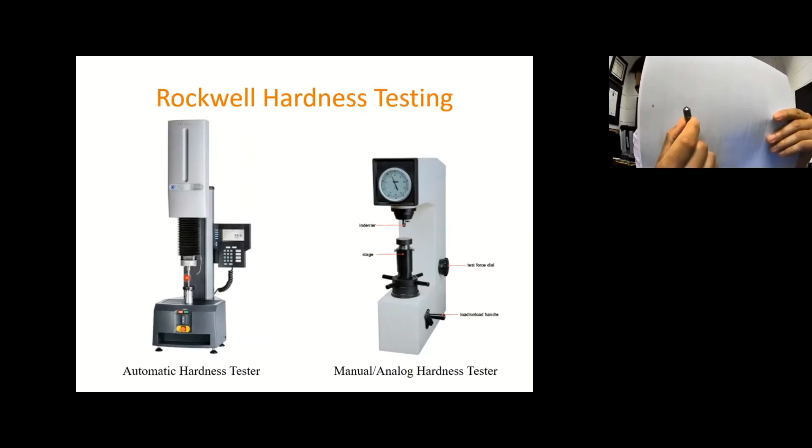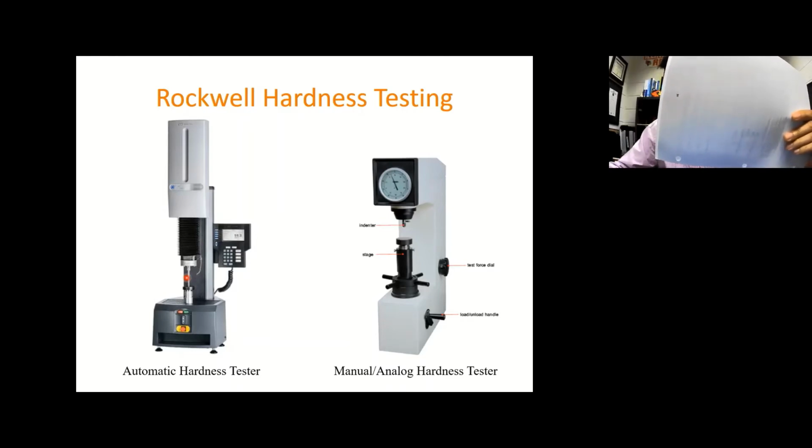Here is an indenter for the Rockwell C scale, and this has a little bitty diamond, I'm sure it's a synthetic diamond, on the very tip of it, and so it's pretty sharp and very hard. Diamond is very hard. So that is the indenter that we're going to use for the Rockwell C scale, which is the hardest scale to measure the hardest specimens.